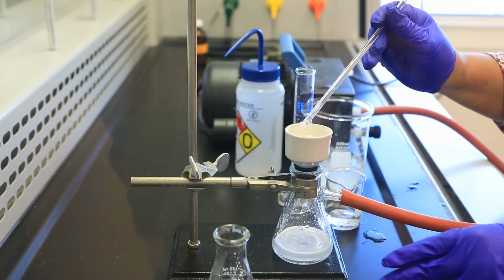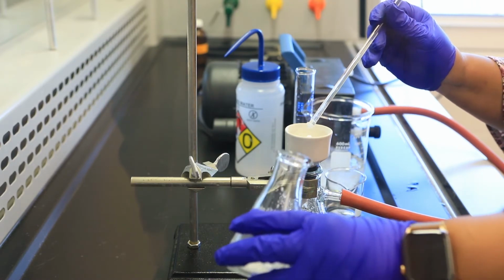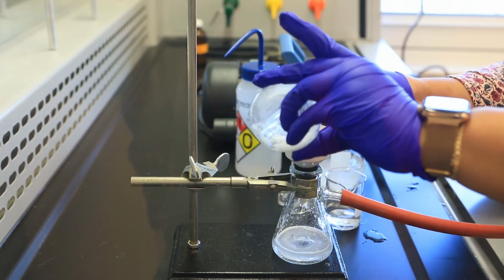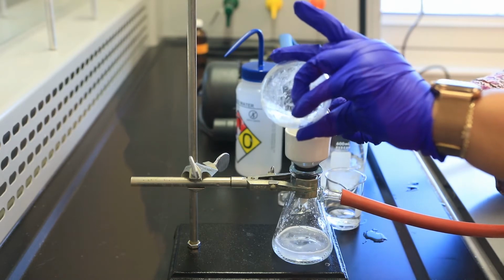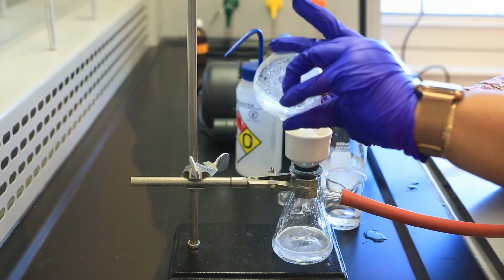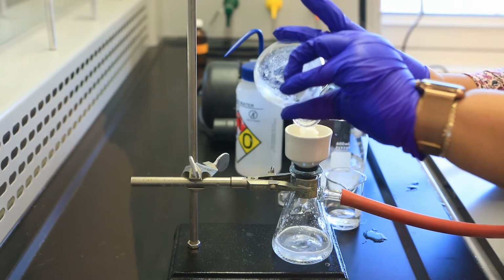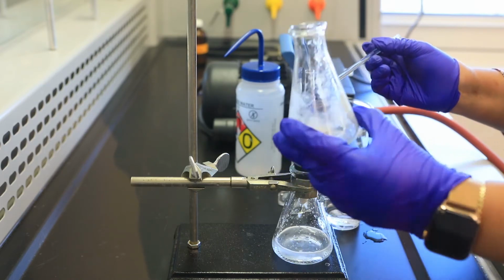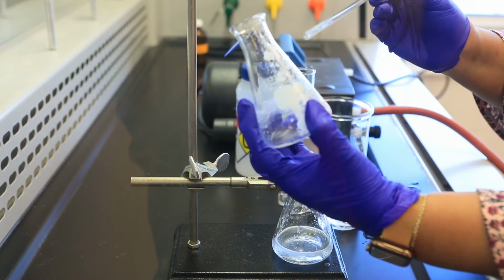What is over here could actually be a clear colored solution, but somehow it appears to be a bit cloudy, but I can see that we have not lost any of our crystals, so I'm going to continue on with this process. So I'm transferring the aspirin to, of course, the Buchner funnel. Now you'll notice that there is, of course, a solid along the walls of that container.